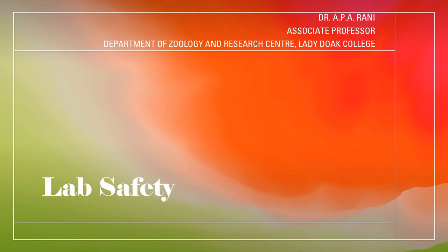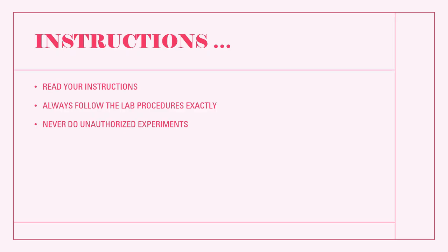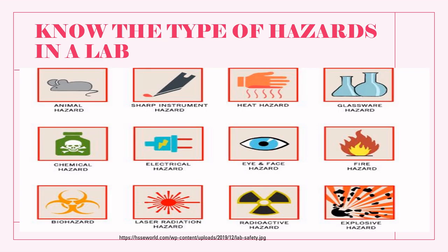Good morning and let's see about lab safety. Always read the instructions that are given to you carefully and follow the lab process exactly as given to you. Never do unauthorized experiments. Know the type of hazards that you have in a lab.